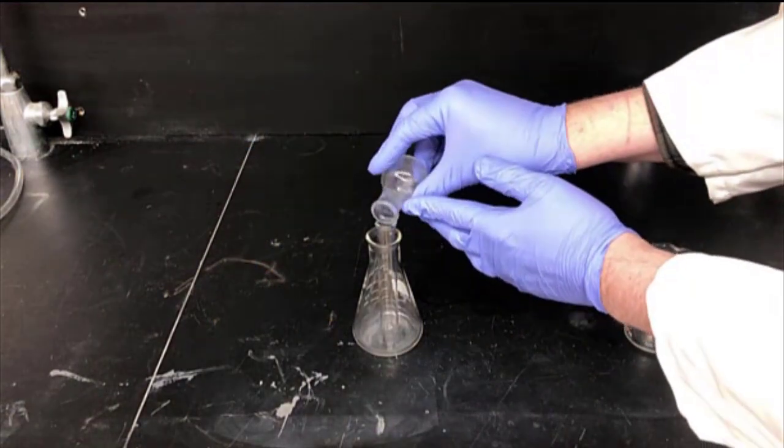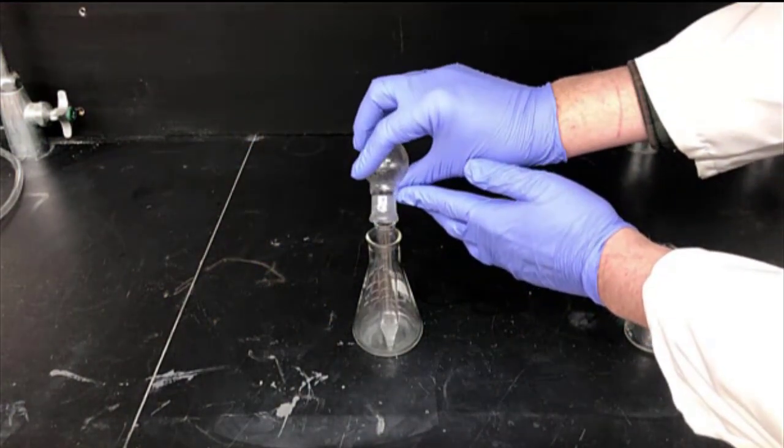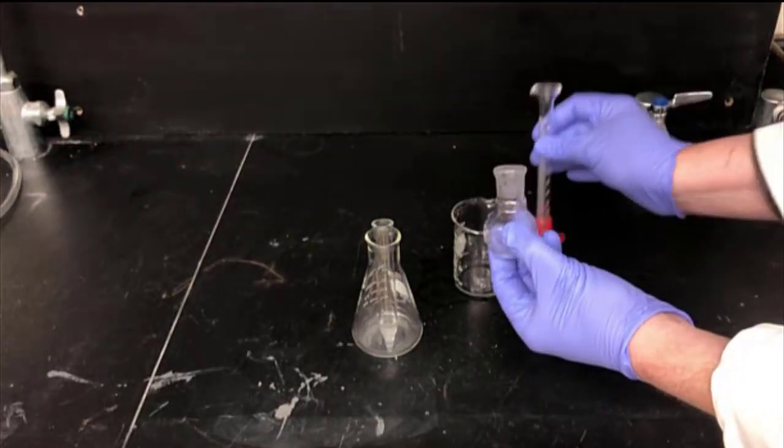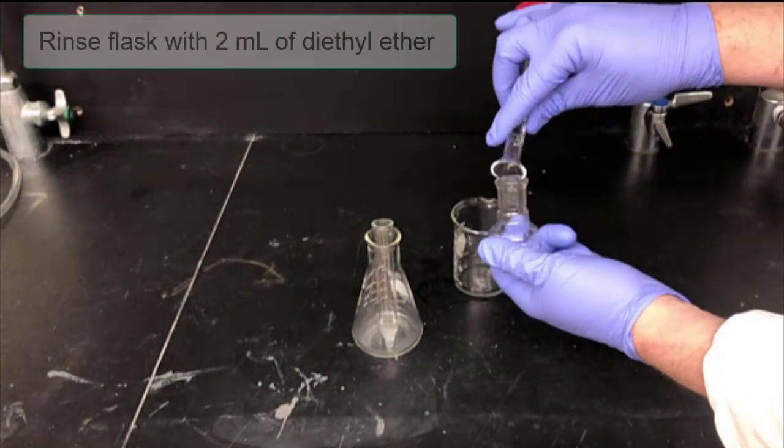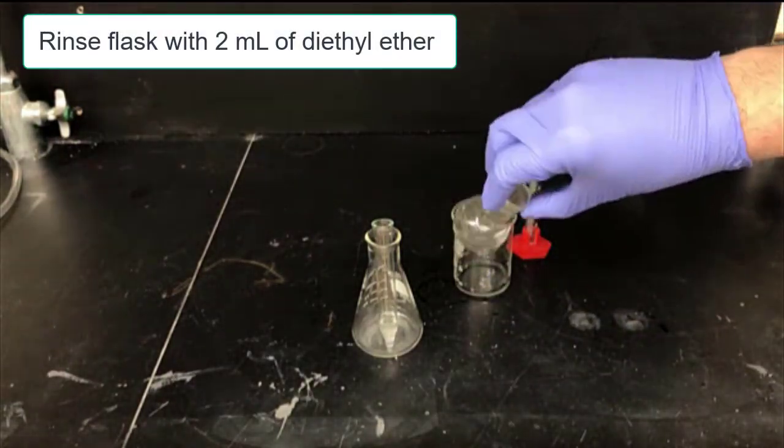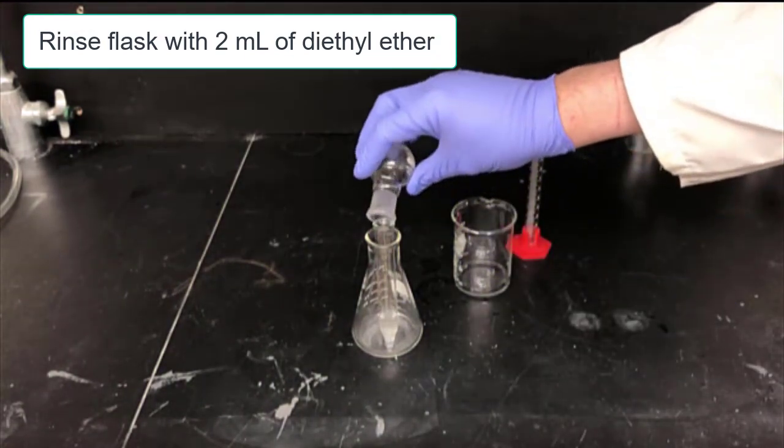In the next step, transfer the reaction mixture into a point-bottom test tube. These are sometimes called centrifuge tubes. Then rinse the round-bottom flask with two milliliters of diethyl ether and add the diethyl ether to the point-bottom test tube.